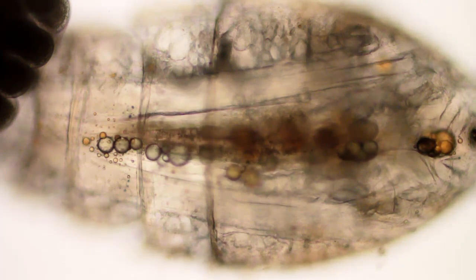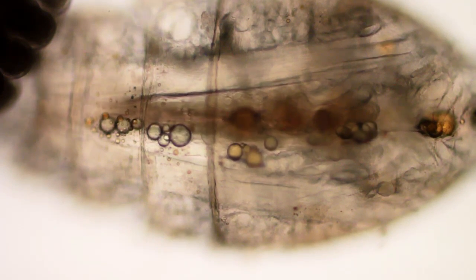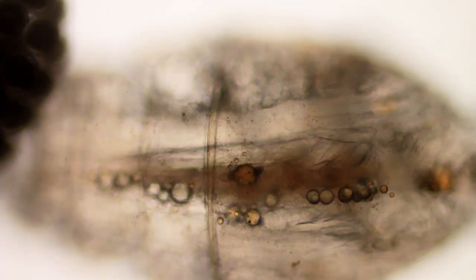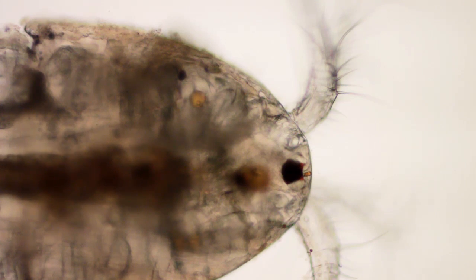Let's go to 10 power here. I don't know — the different colored spheres I think are bodily fluids, I'm not sure. Let's see if I can focus in on that eye — yeah, there, the red cross thing there. Actually it's a 5-point star in the adults.